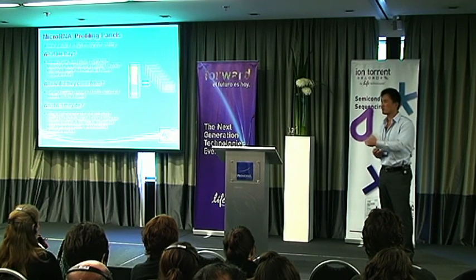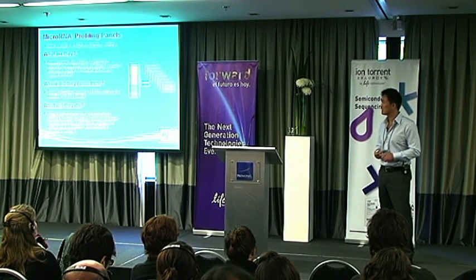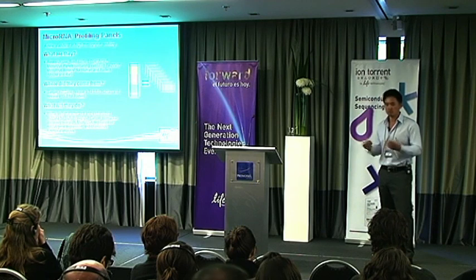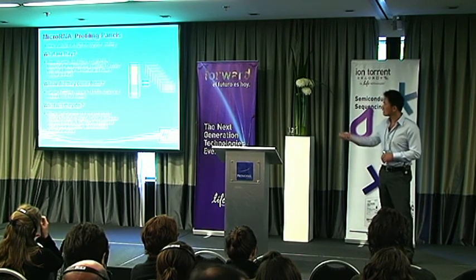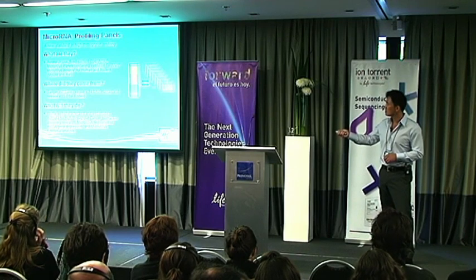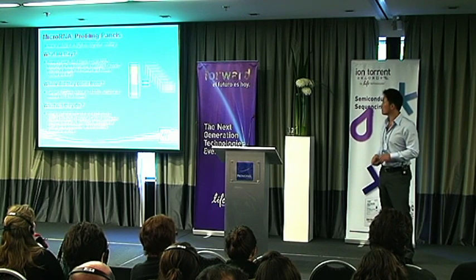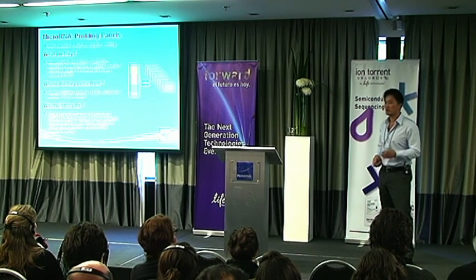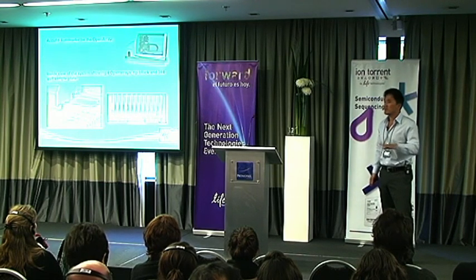And so the workflow was kind of tedious, and if you had a smaller project size, that would be fine. But if researchers were literally looking at dozens, hundreds of targets, we thought instead of running multiple cards, we'll just spot the content, because of the throughput capabilities, onto the array itself. So we've been doing very well with the microRNA panels. Those were the assays that were spotted.